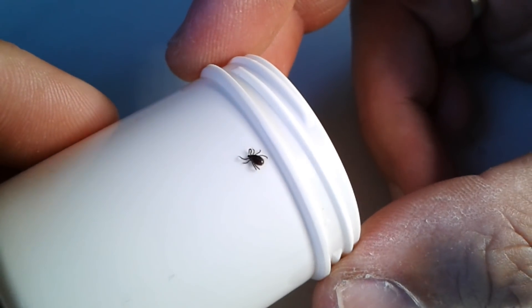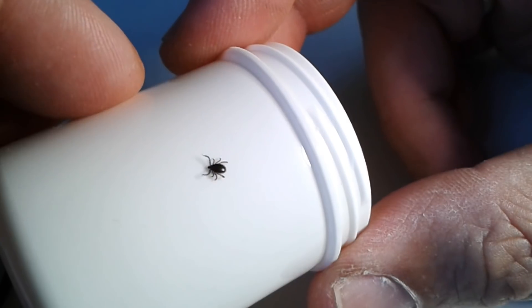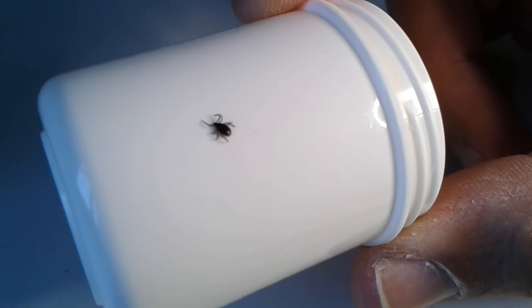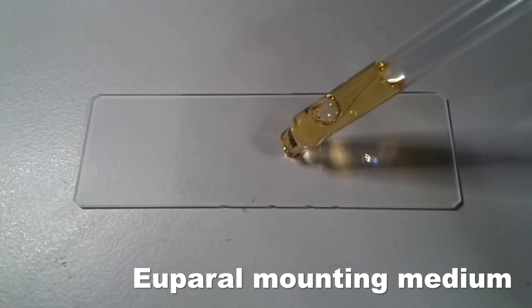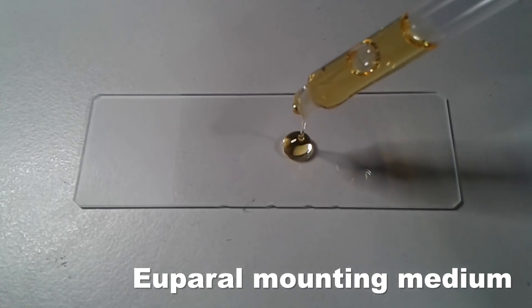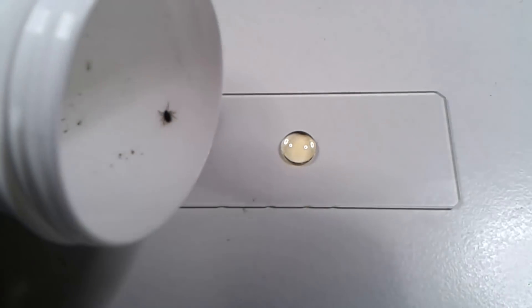What I'm going to do now is put these ticks under the microscope, because otherwise they have absolutely no use for us. The first thing I did is I placed a drop of Euparal mounting medium — one of my more favorite ones — on the slide, and then I tried to place the live tick into the mounting medium.